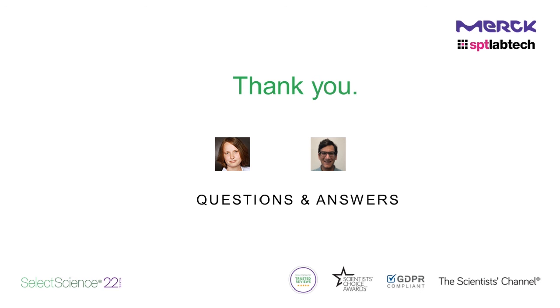The compounds themselves, we never dispense with the dragonfly discovery. For the compounds, we are still using our Echo systems here. For DMSO-based solutions, we are using the Echo. However, for all kinds of other reagents, we are using the dragonfly.